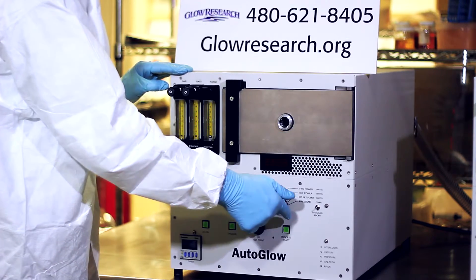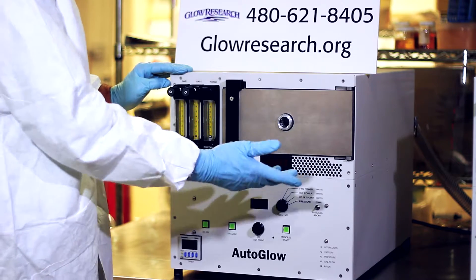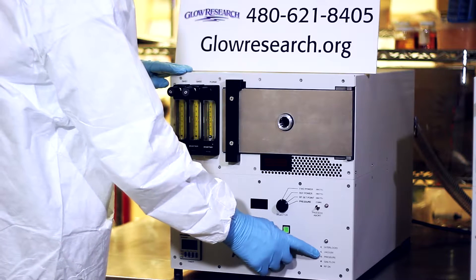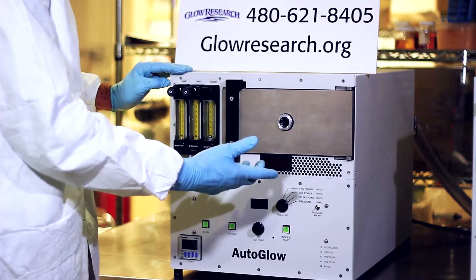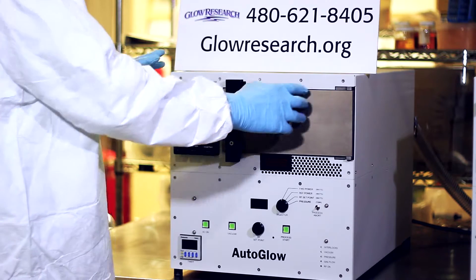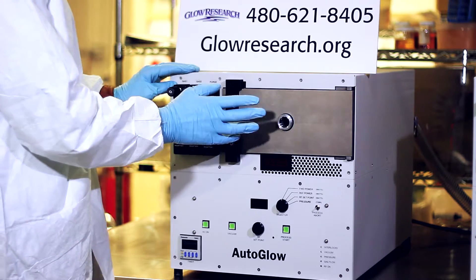As the system is pumping down and it reaches 0.5 torr, you would press this button. That would set the crossover pressure at 0.5 torr and automatically start the system. This right here is your DC bias readout. Down here we have a diagnostic display which is very good for confirming that all the sub-modules in the system are working correctly. Glow Research is very proud of this system — we do everything in the design to keep the RF containment and keep the reflective power down to a very small minimum.